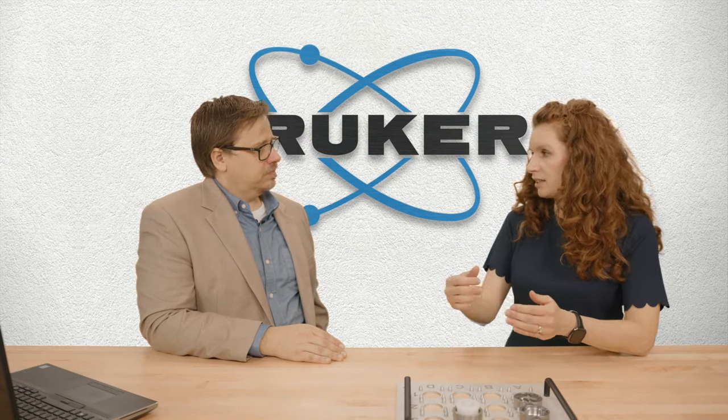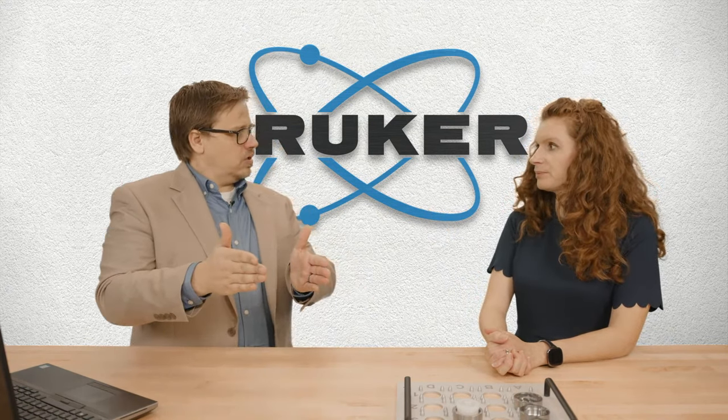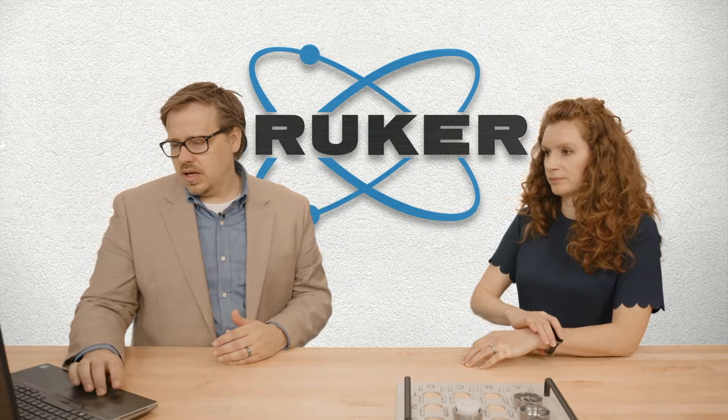And if you run a sample over and over, you would get a standard deviation that's even closer than the standard deviation of your calibration curve. And then you use the standards in order to make sure that that very precise measurement is right on target. So you get the accuracy. All right, great.